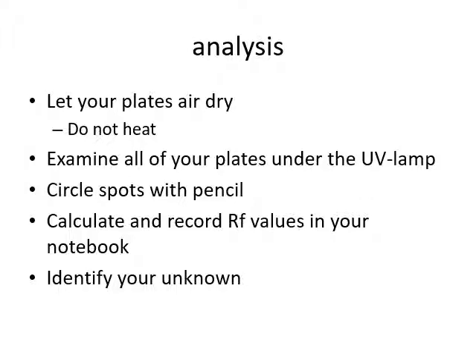After the experiments are done, you let your plates air dry. You just take them out. Remember not to touch them by the face of the plate, and you just leave them in the fume hood as they're evaporating. And then you examine them with UV light, and you circle the spots with a pencil so that you don't forget them once the UV light stops. And you calculate and record RF values in your notebook. And hopefully you would identify your unknown.